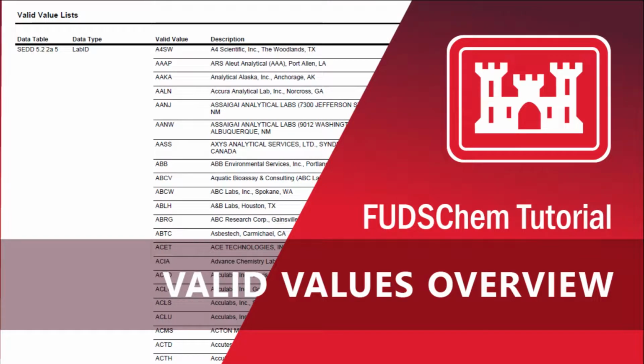This video will go over valid values, what they are, why they are important, where they come from, and how to request new ones. Valid values are codes that a database uses to represent data, such as a company, sampling type, or analytical method.